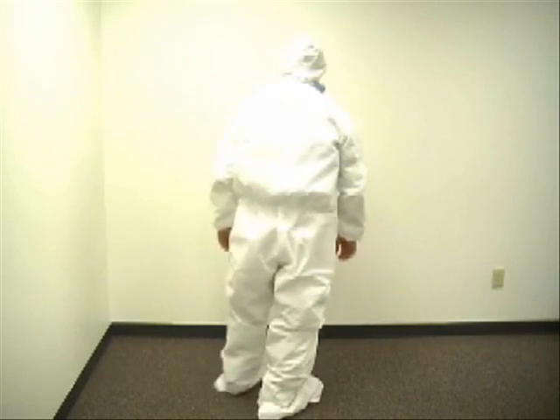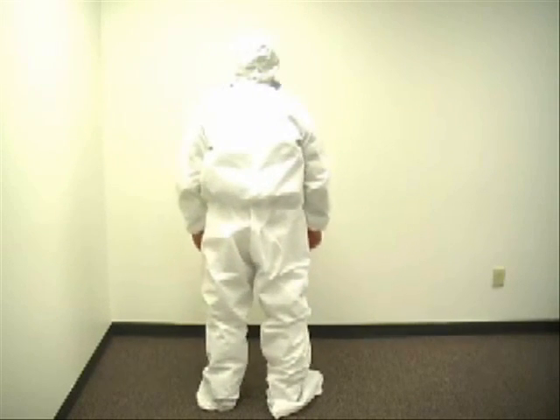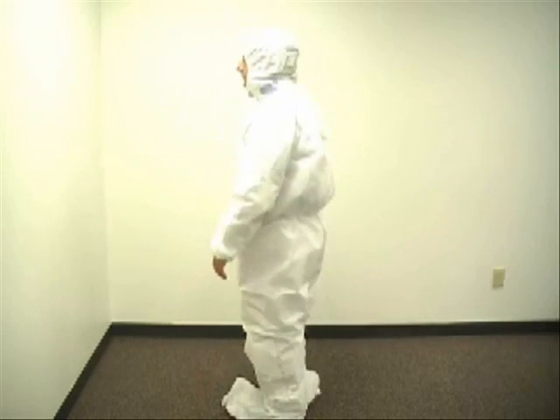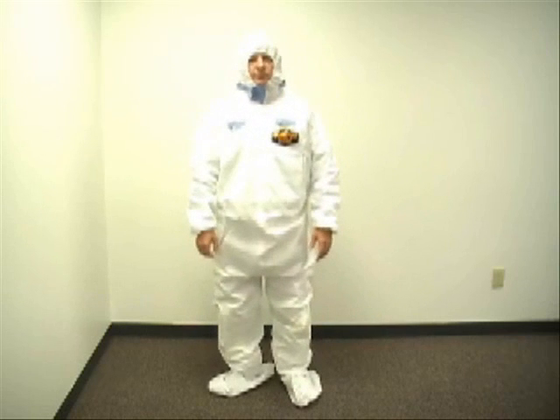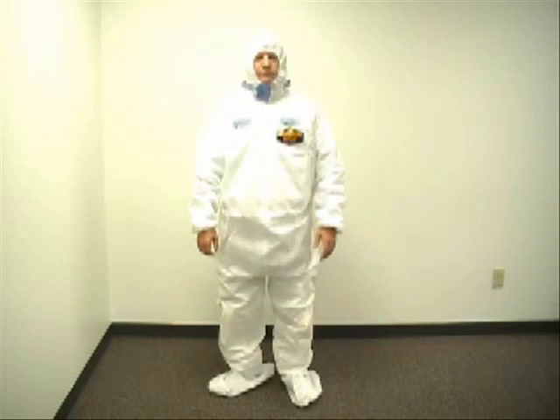The Q-Guard Quantum Wear Suit features several patent-pending design attributes that minimize the chance of worker contamination and exposure to harmful radiation and particle infiltration, in addition to increasing the level of comfort to promote increased productivity.